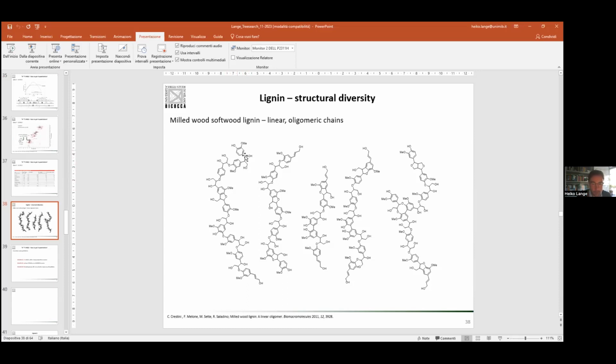So in the HSQC, we see, for example, this carbon here, because it is an aromatic ring carbon that carries one proton, right? One hydrogen. We will not see, for example, this carbon here, because this carbon here is only connected to other carbons and to the methoxy group and not to a hydrogen.